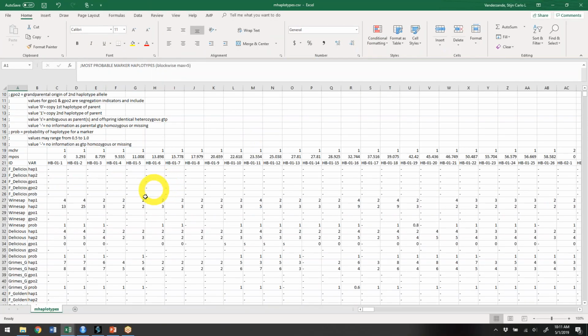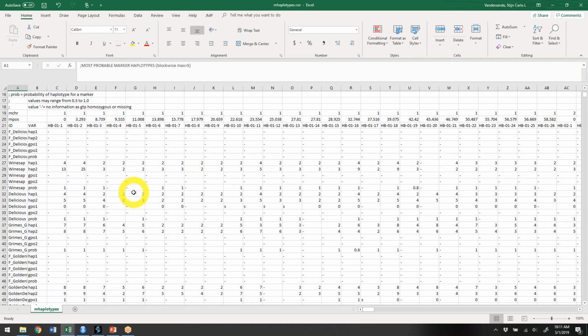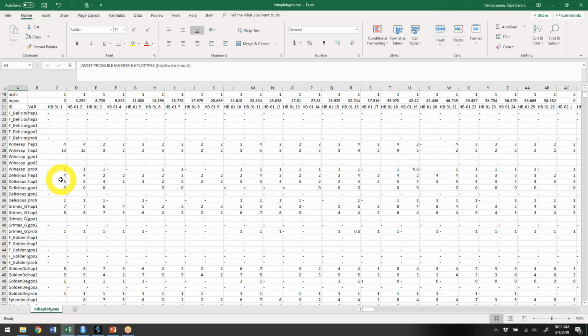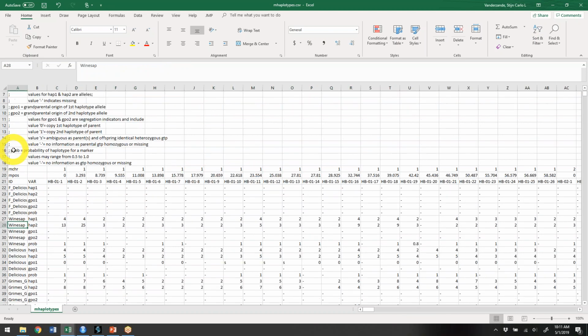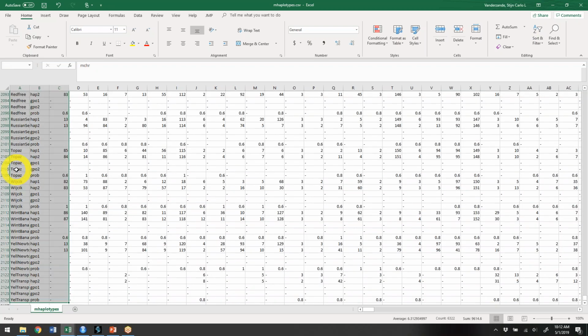So the haplotype files look still the same as what it looked like for individual SNP data, but now it has these haplotypes, and so rather than saying which SNPs are in the same homolog, it's showing here which haplotypes are in the same homolog. And so what I do is I just copy this part of the table because I don't really need the rest.